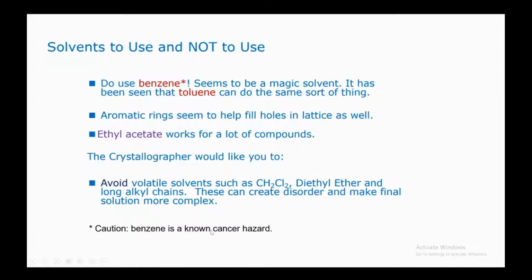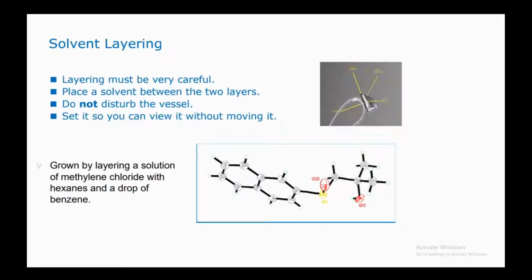Caution: benzene is a known cancer hazard. So if you can avoid benzene as a solvent, then avoid it. But if you can't, then go for it. Use it. A crystal is more important than the hazard of the chemical benzene.